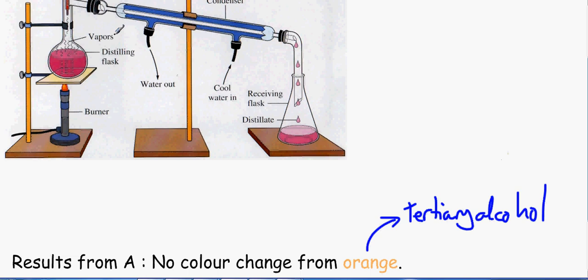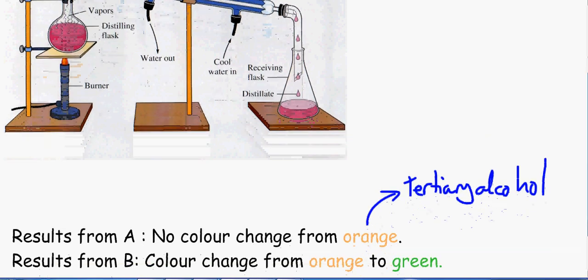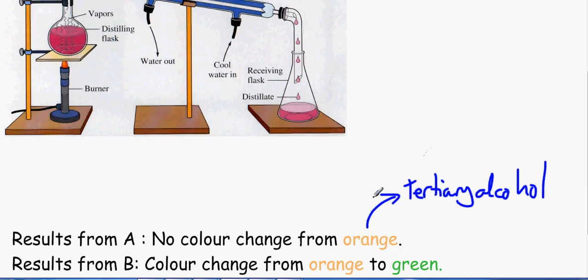So the second one we put test tube B in, obviously in the new one. And we have a colour change, fantastic, from orange to green. So we know that it's either a primary or a secondary. We don't know which one it is.